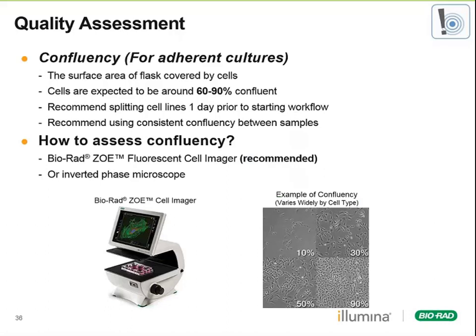Again, this is going to vary widely with cell type, as cells will look very different in different culture conditions. A tech support quick tip, this would be a great place to capture images of your cells in case you want to go back and compare culture conditions in later experiments.